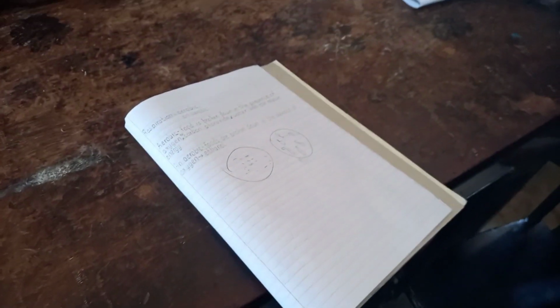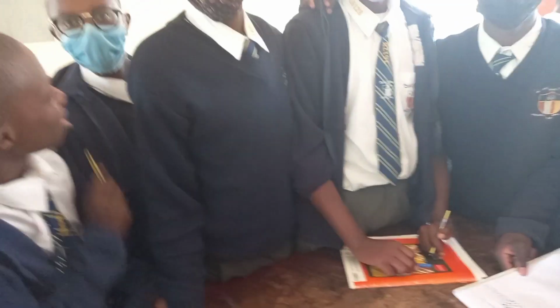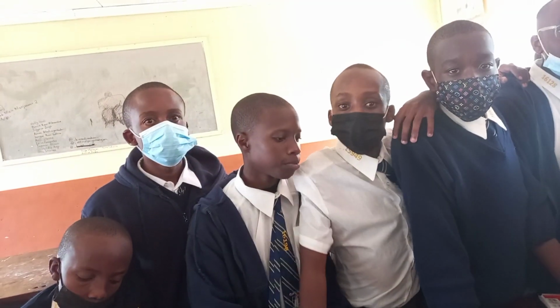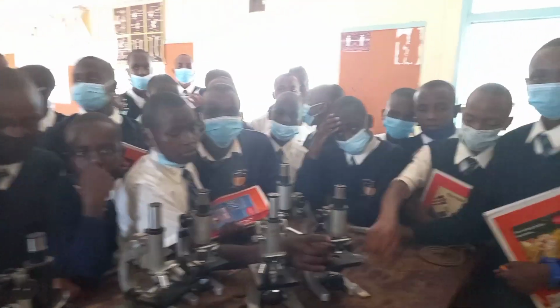Which one shows a wider part of the specimen? The low power. It magnifies less. That's why you're able to see a wider part of the specimen. Bring all the microscopes up front, because now we are done. Have you brought all the permanent slides?